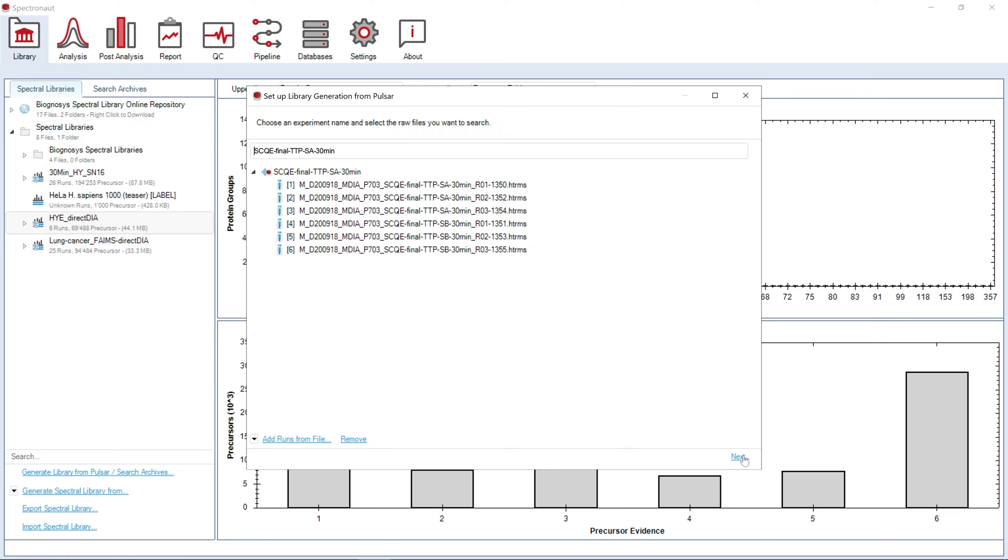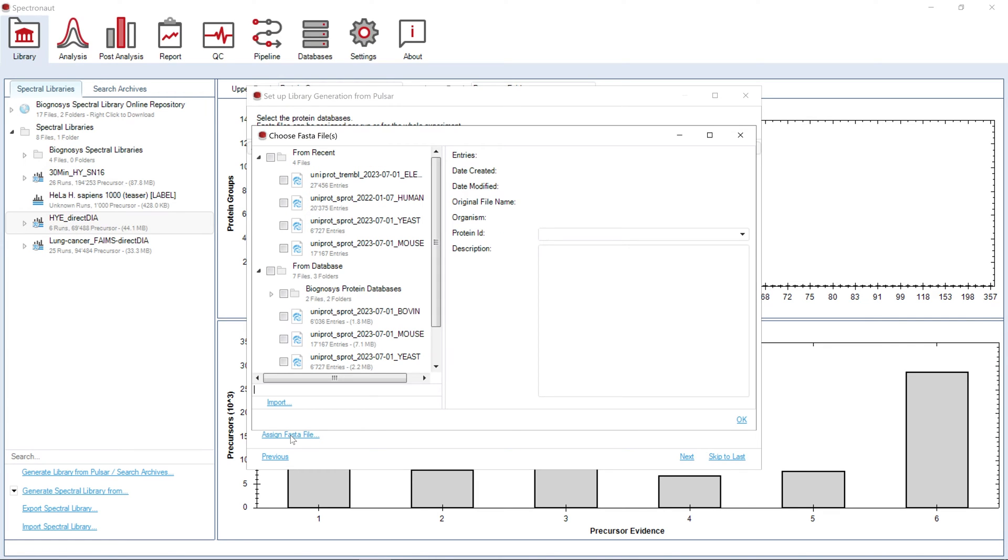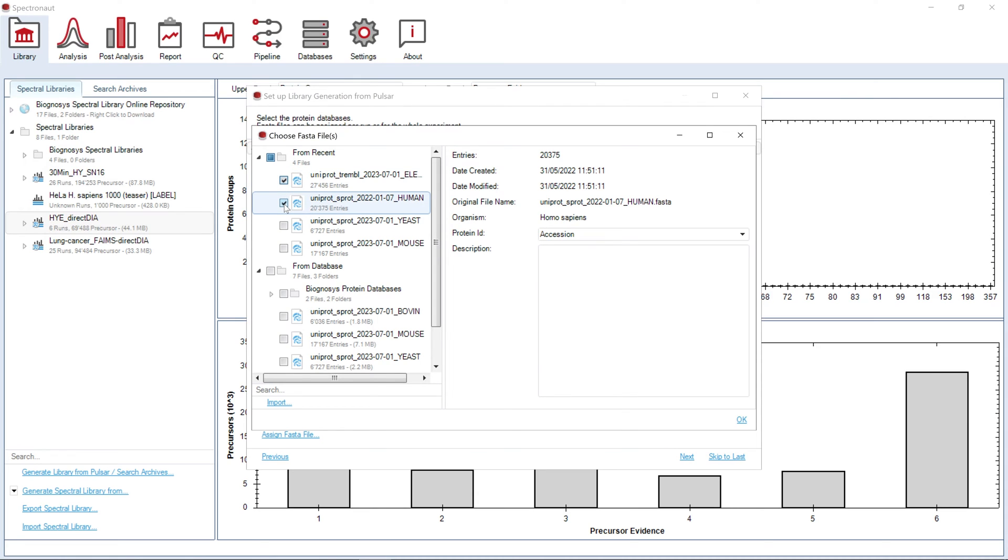In the next step, we will select a FASTA file. If you perform a multi-species experiment, you can upload FASTA as one merged list of protein accession numbers from different species, or you can upload each FASTA file separately.